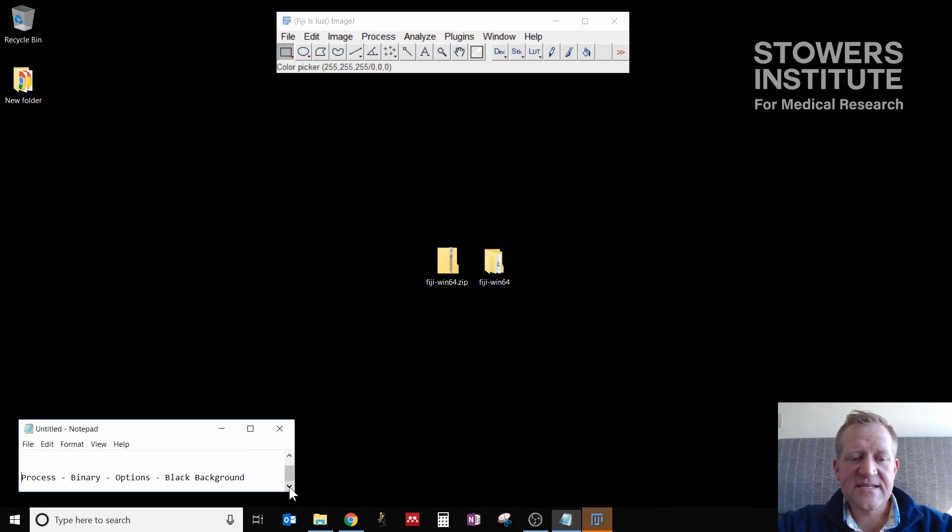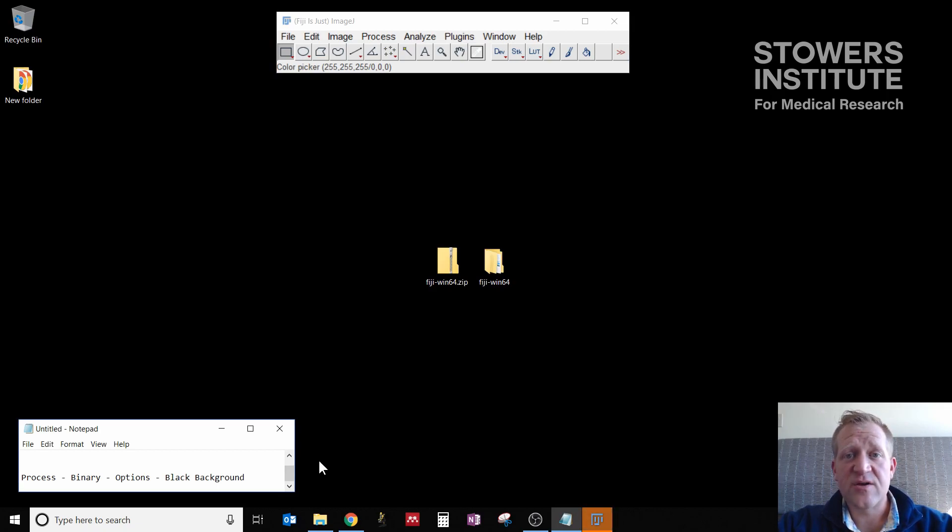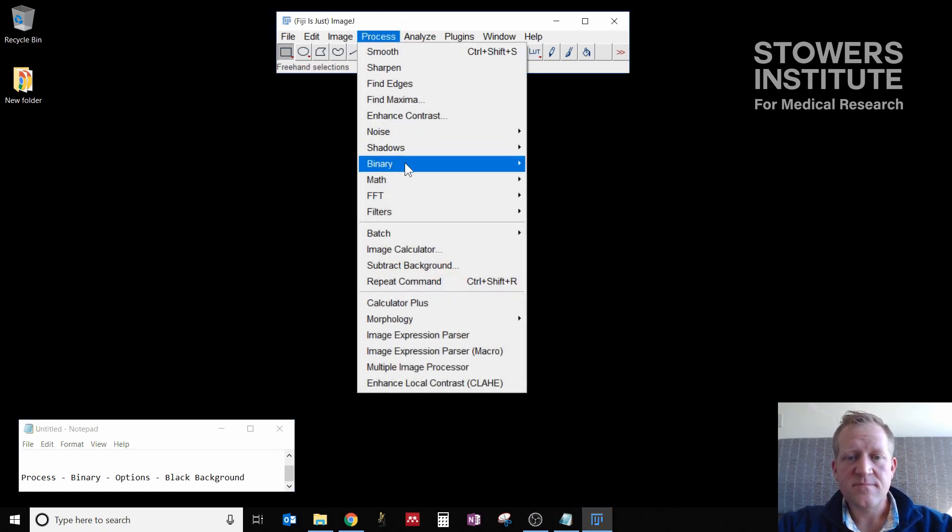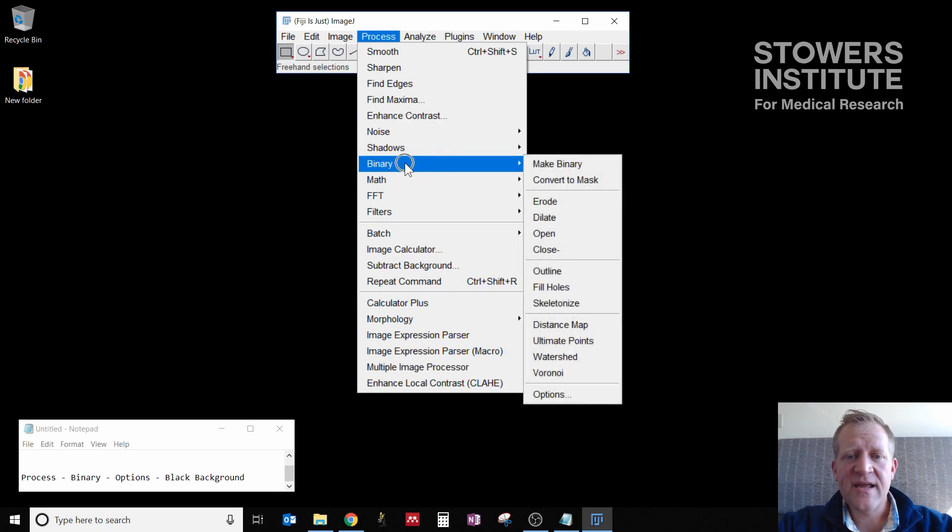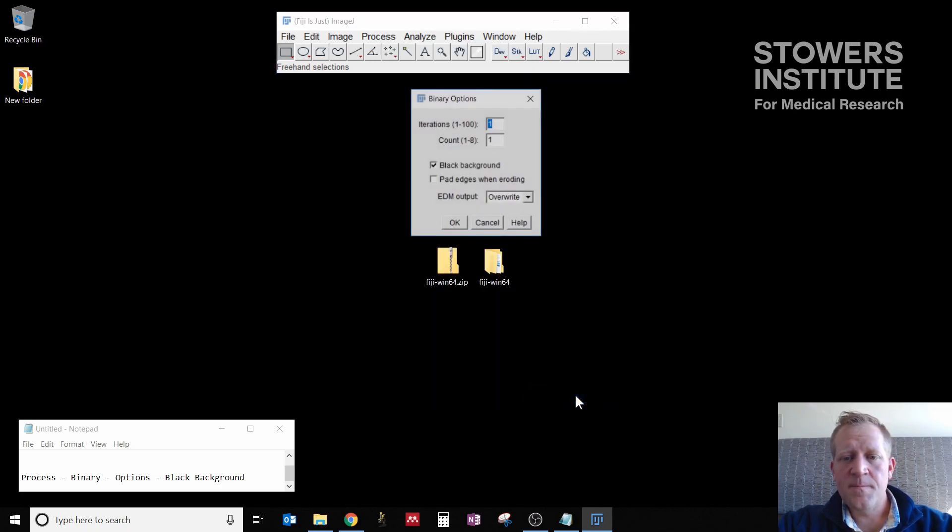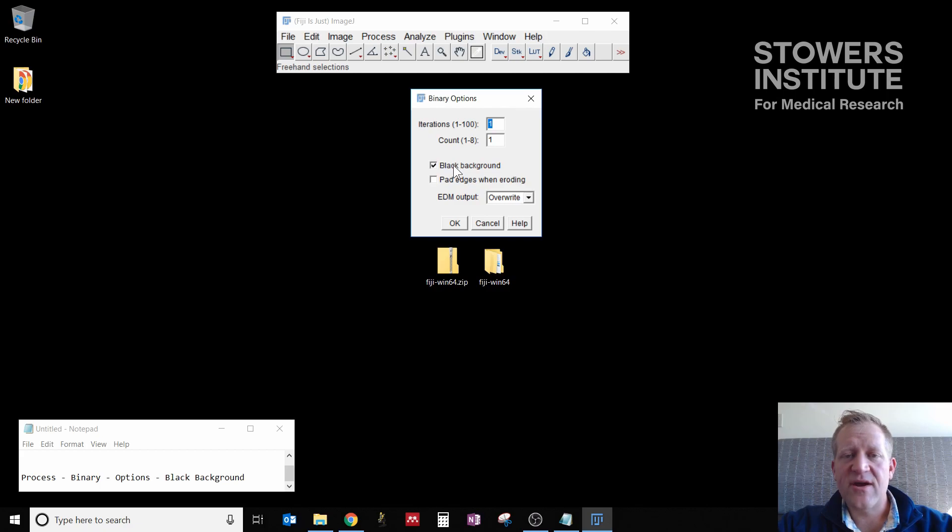Okay, the last setting that we want to do is since we're going to be using a lot of fluorescence data, we're going to want to make sure that our background for processing is set to black. To do that, we're going to go through Process, Binary, Options, and we're going to make sure that black background is selected. In this case it is, so we just click OK.